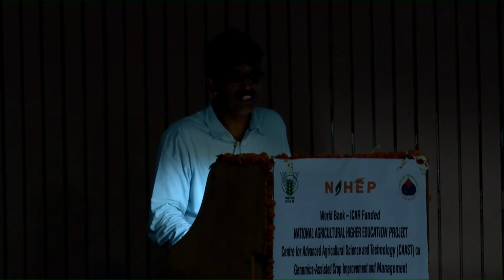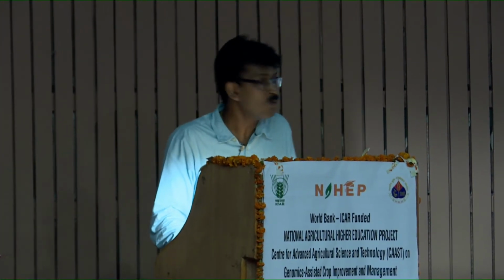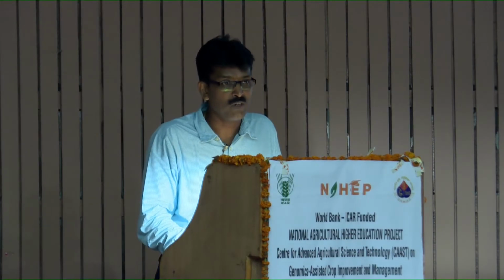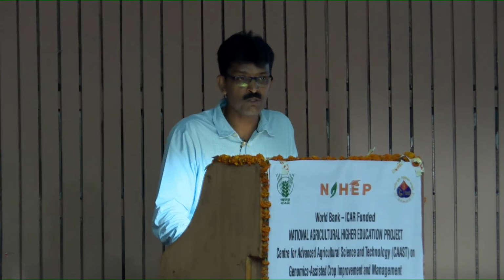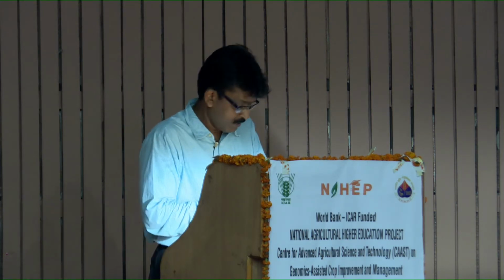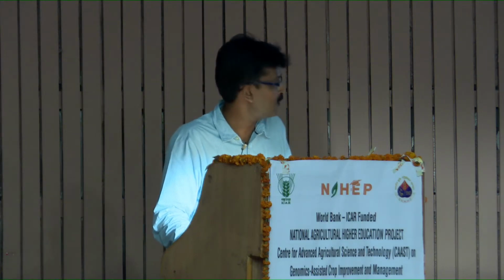And I already made a point here. In conventional PCR, you are bothered about what is amplified, right? And in the case of real-time PCR, you are bothered about how much is amplified. That's a big difference, right? So in addition to what is amplified, you are also going to address how much is amplified. So this is the fundamental difference between conventional PCR and real-time PCR. And a specialized technique allows you to monitor the PCR reaction in real time.